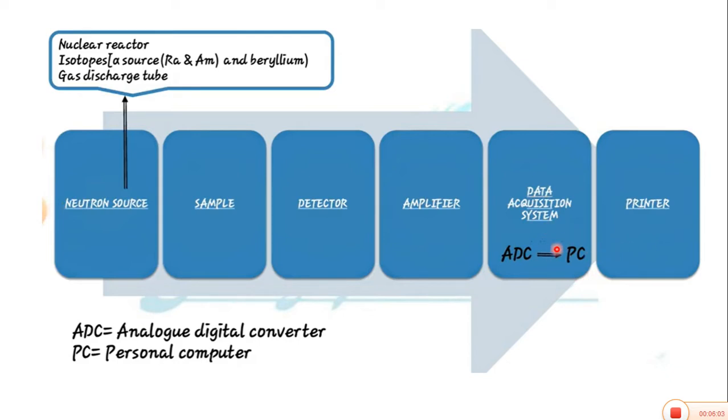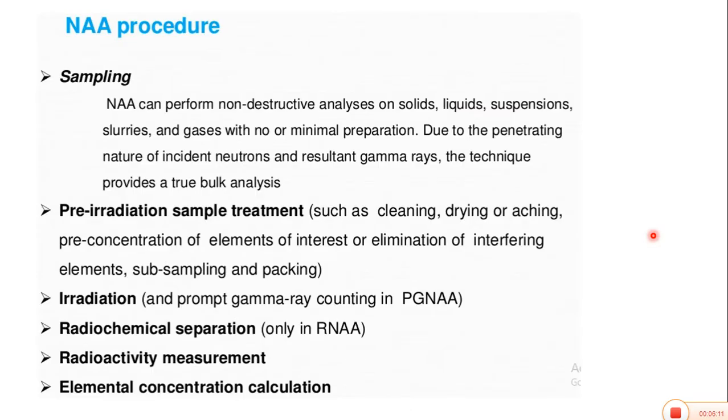So this result could be printed for further process. Okay, so another way, there is sampling material. A lot of time I have discussed with you, there is no such type of preparation required which we actually use in atomic absorption spectroscopy, but here is a very simple process involved for the preparation of sample material: just purification or cleaning of the sample material.